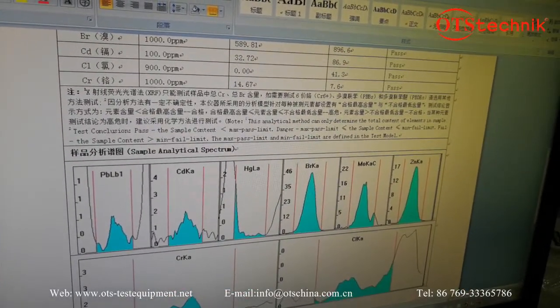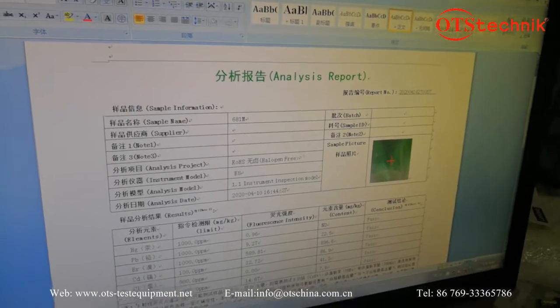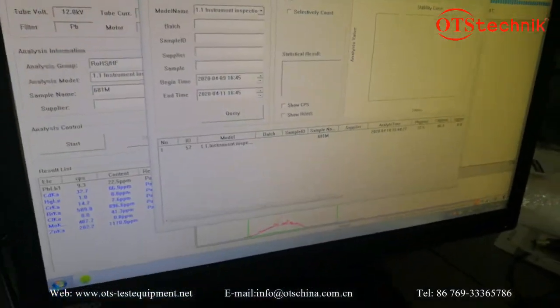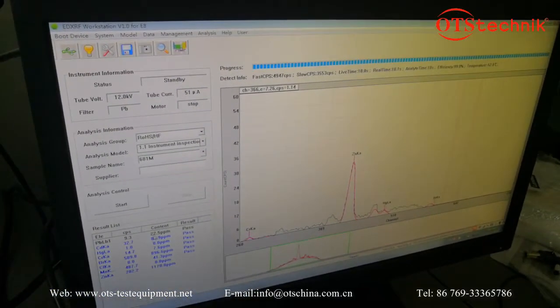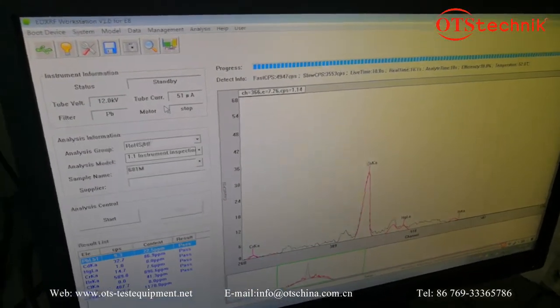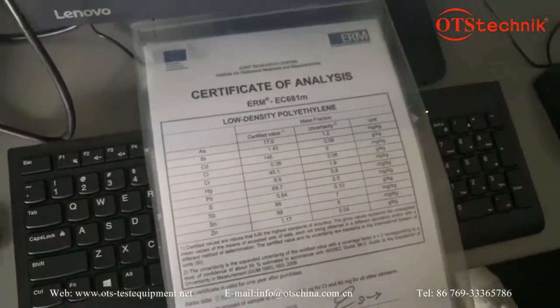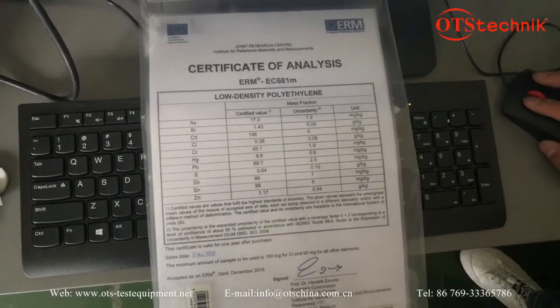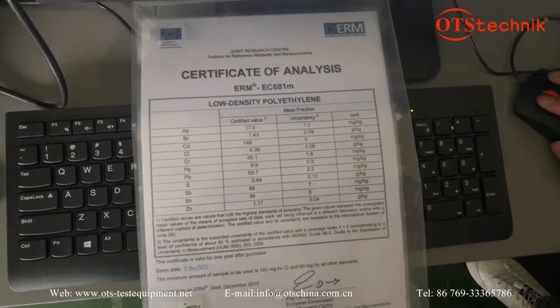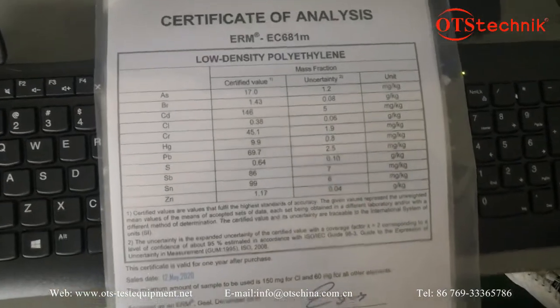The report is available in both English and Chinese. This report you can edit yourself. This is the standard certificate. After you have finished the calibration of the machine, you can use these parameters to compare with this certificate to verify.